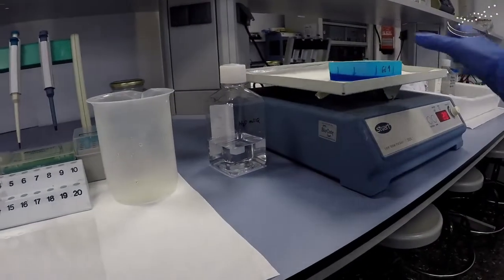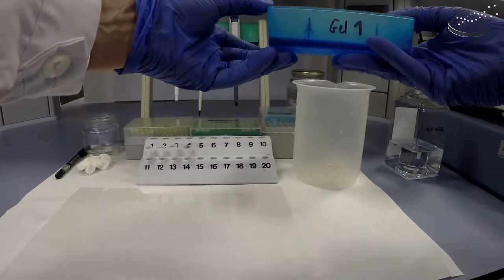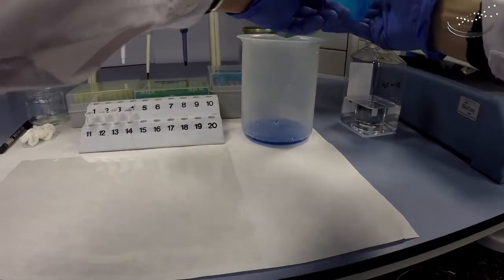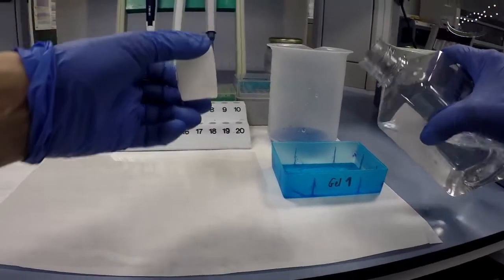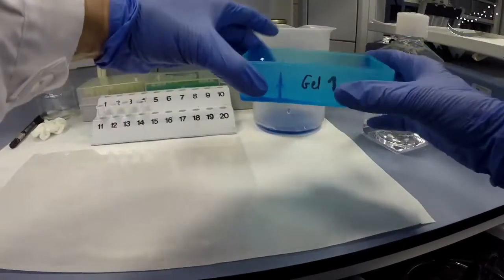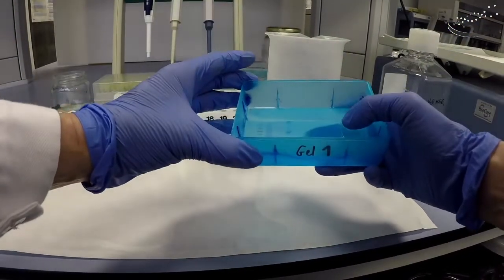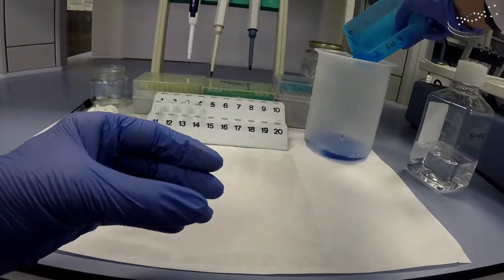Now that 20 minutes has gone by, we take our gel off the rocker and discard the stain solution by decanting it into the beaker, holding onto the gel so it doesn't fall in as well. With this staining solution, the washes are with water — depending on your staining system, the destaining solution will be of different compositions, but with this one it's very convenient: just Milli-Q water. Rinse the gel off, press down slightly on the corner to hold it, then decant the water off.